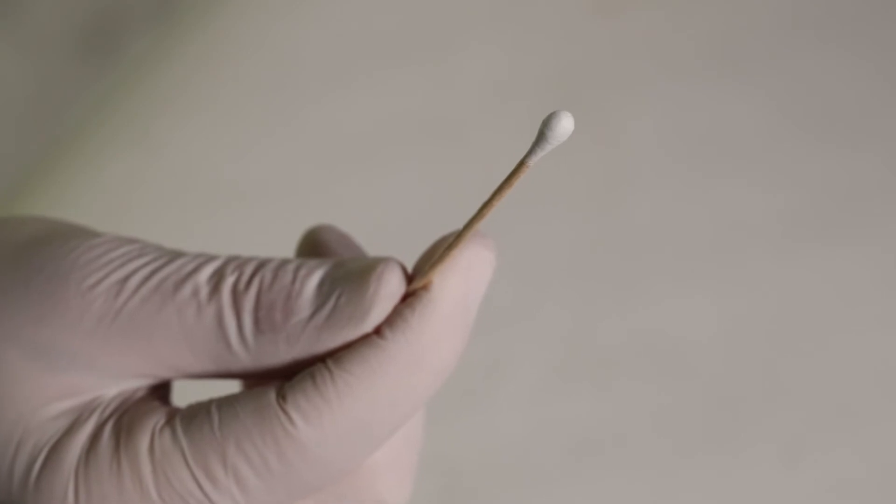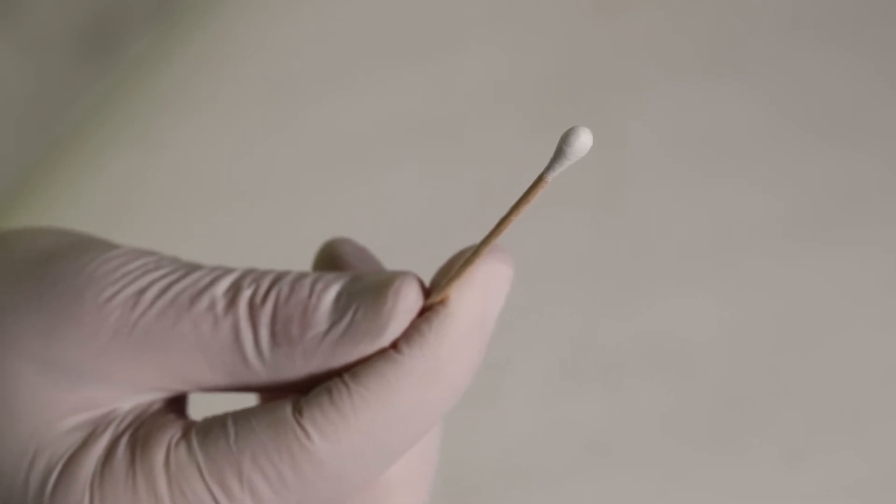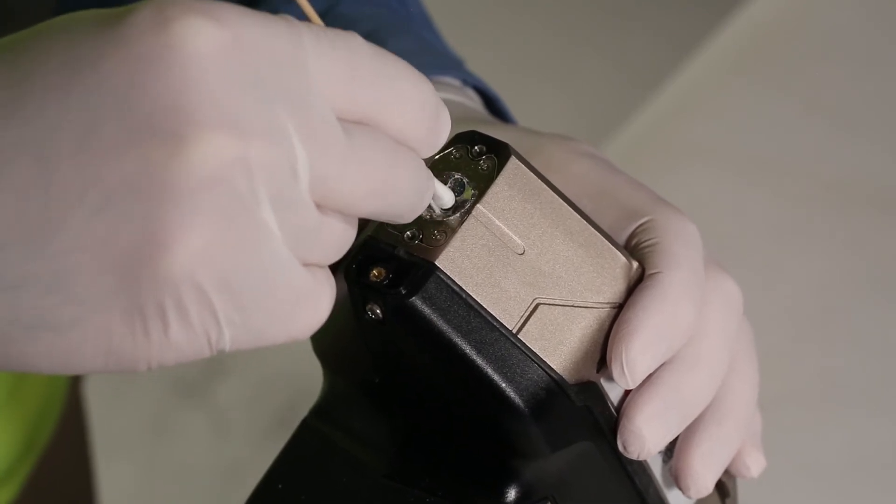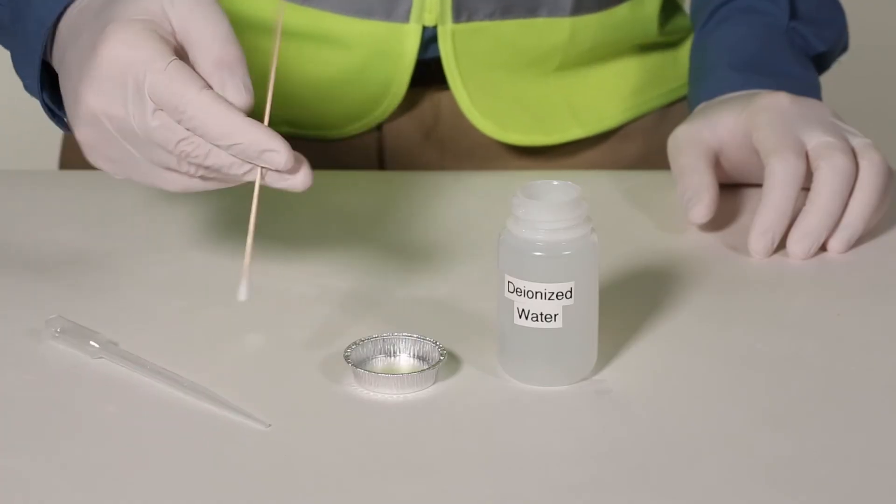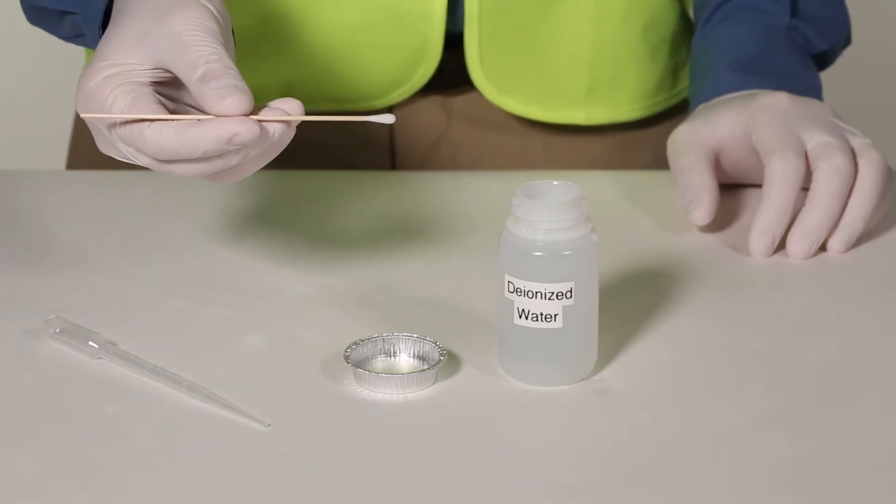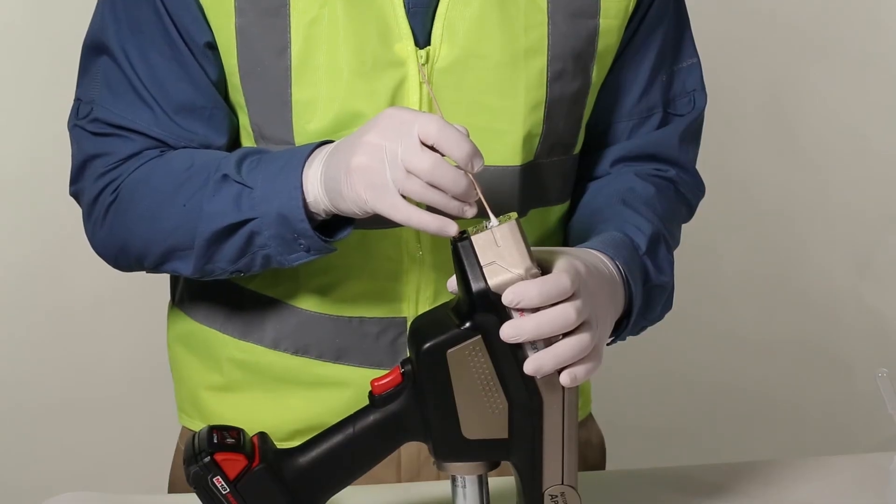Once the swabs stop becoming dirty, the laser windows are sufficiently clean. Clear any loose or dry cleaning mixture from the sample chamber by using a dry cotton swab. Proceed by dipping a new cotton swab into a small amount of deionized or distilled water and remove any cleaning mixture from the sample chamber.